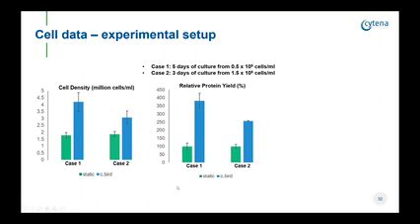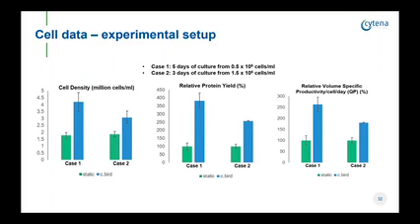The relative titer increased more than twofold in both studies, and since a higher protein yield can be expected from a higher number of cells, we also calculated the relative volume-specific productivity per cell per day, which you can see on the rightmost plot here on the third graph. And as shown here, cells grown in suspension are also more productive.